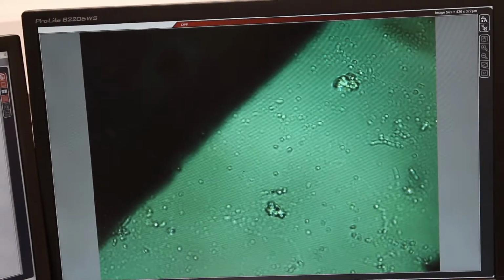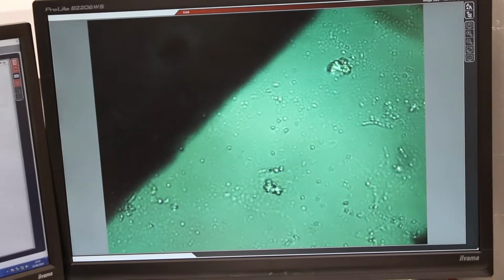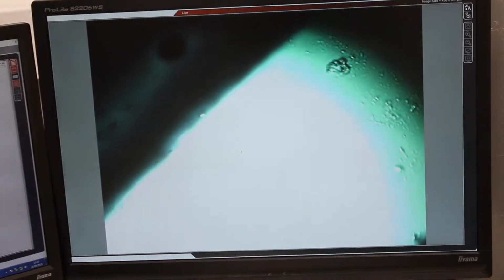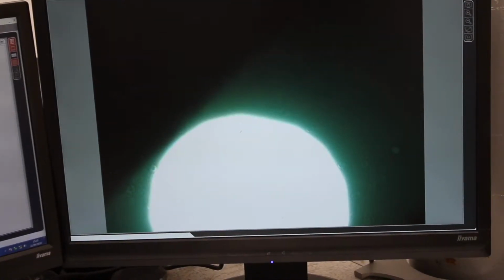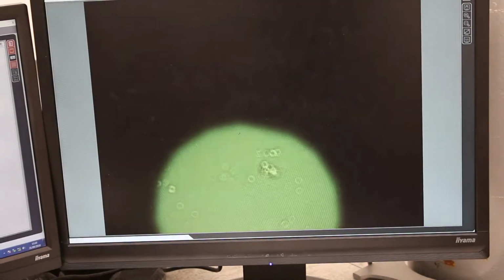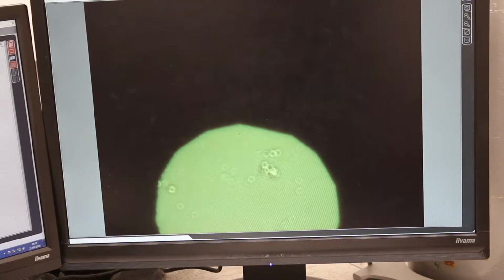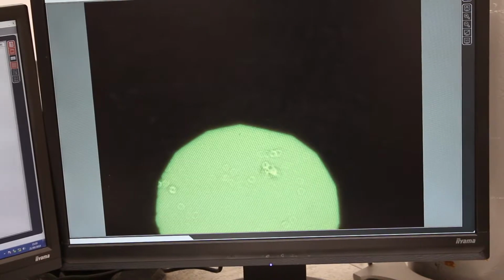So that's typically the condenser lens is out of focus because I don't see the edges of the diaphragm. Then I'm going to move the condenser lens on and you will see now the edges of the diaphragm becoming very neat. Okay, now it's a bit too bright, but you see that the edges are either blurry or neat. And that means that that's the right position for the condenser lens, and it shouldn't be moved. So if the condenser lens is not properly in focus, then your sample will appear a bit more blurry, or the contrast will not be as good.